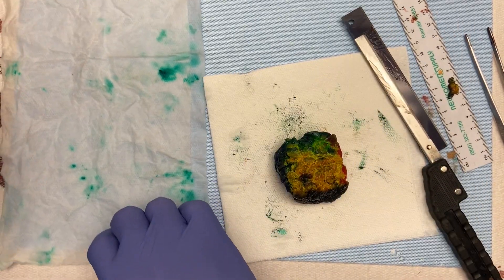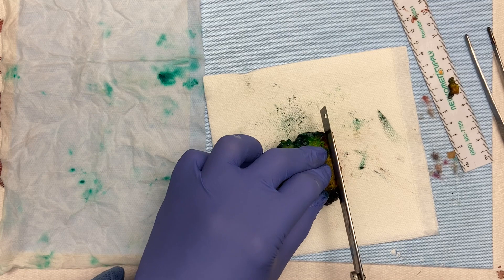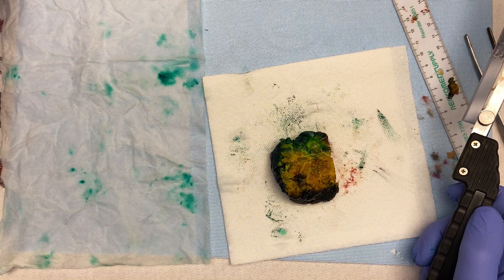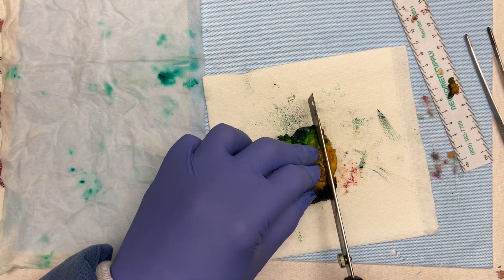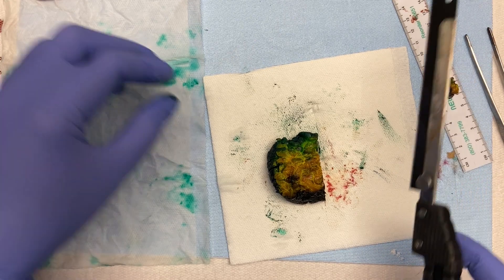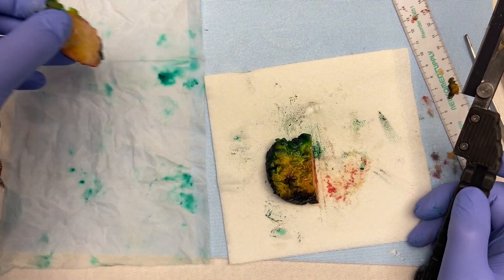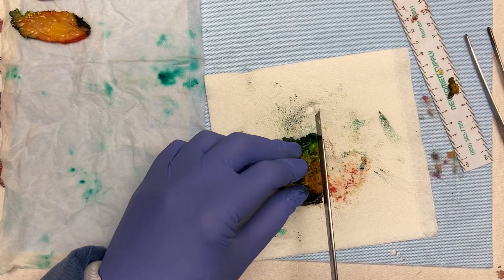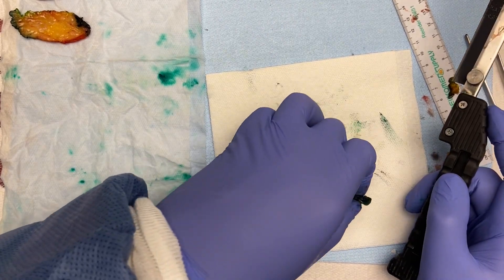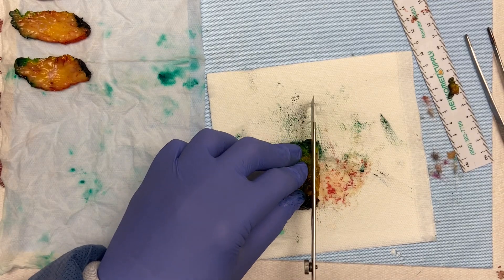Get a paper towel and wet it — if you wet the paper towel, the breast tissue won't stick to it as badly. Make your slices, and they don't have to be super thin. That's a misunderstanding — a lot of people try to get them super thin and they end up falling apart. Get them as thin as you're comfortable with so they stay together, but more importantly keep them consistent. You don't want some slices super thick and some super thin, because a lot of what you're doing in this case is based on the number of slices.